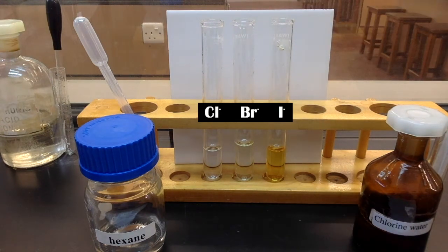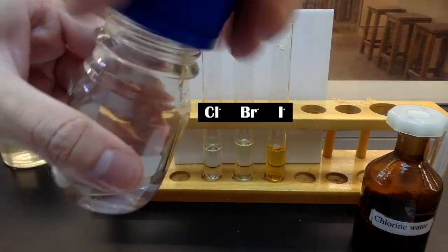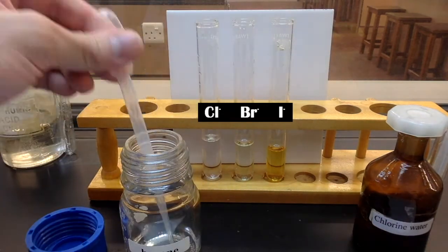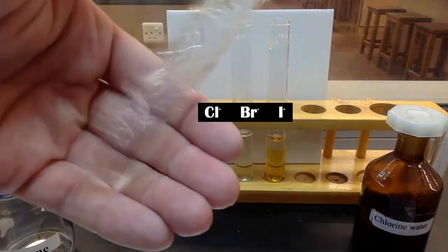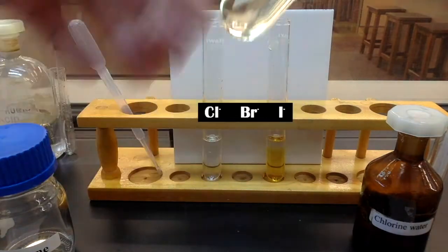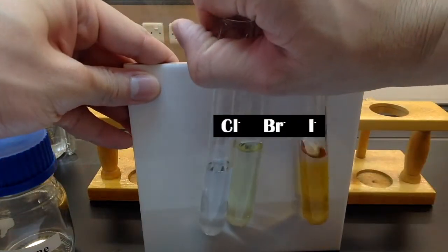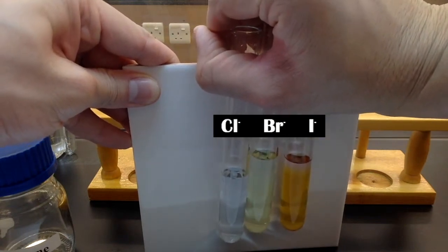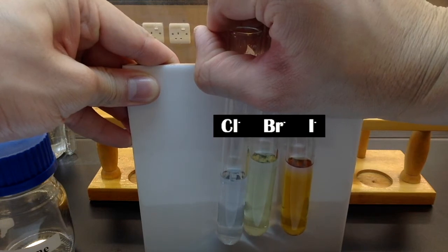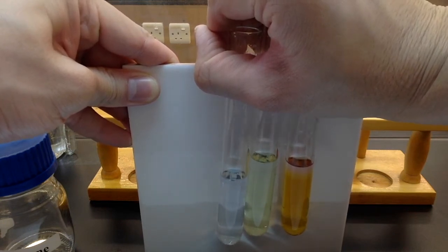To distinguish between the two solutions, hexane was added. The bromine, which comes from the bromide ion, appears orange in the hexane layer. The iodine, which comes from the iodide ion, appears purple in the hexane layer.